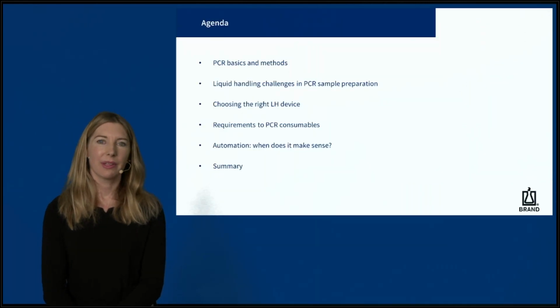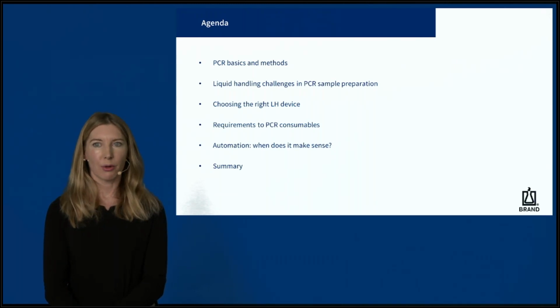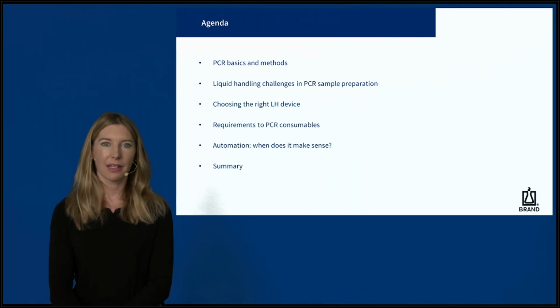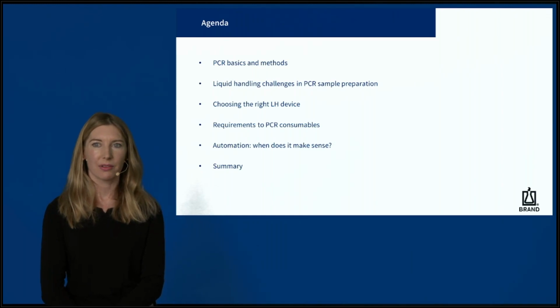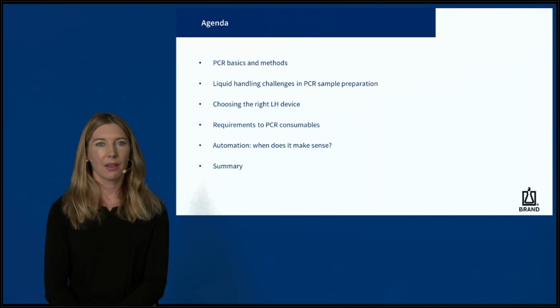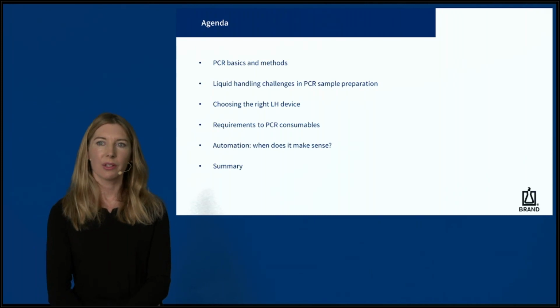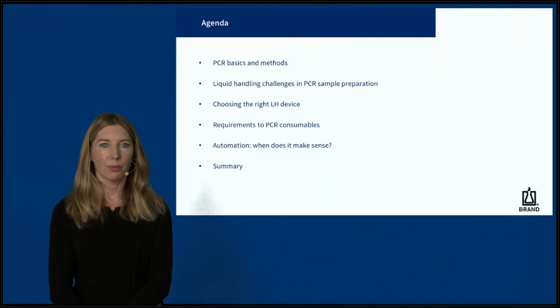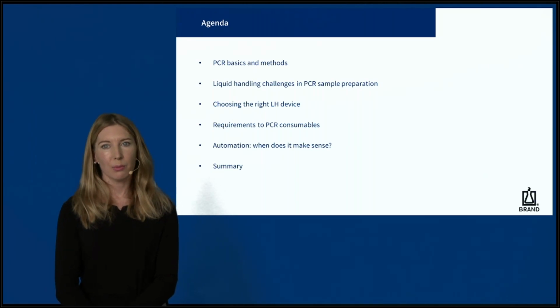Let's just run quickly through the agenda. First of all, I'll start by looking at the PCR basics and methods. Then I want to illuminate liquid handling challenges in PCR sample preparation. Then we go on with the important question, how to choose the right liquid handling device. Another important aspect are the requirements to PCR consumables. We also want to find out when it makes sense to think about automation. And finally, let's have a short summary of the most important aspects.